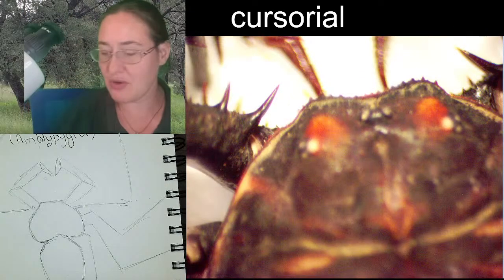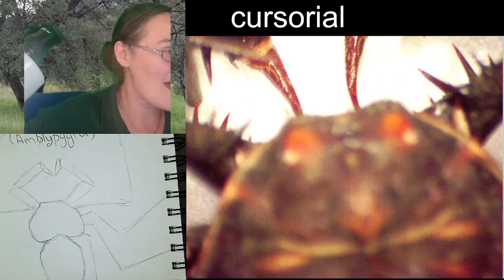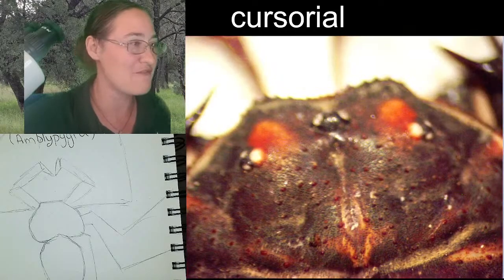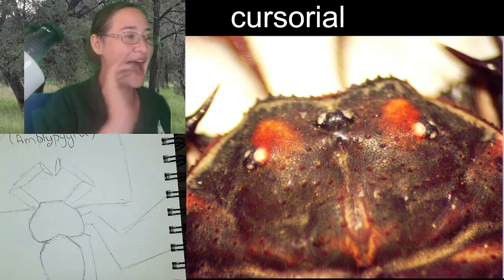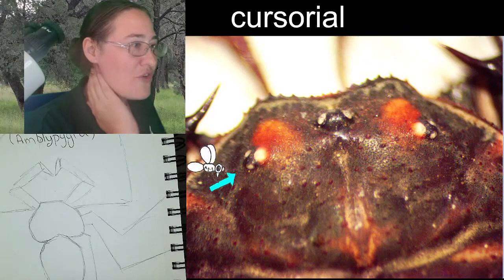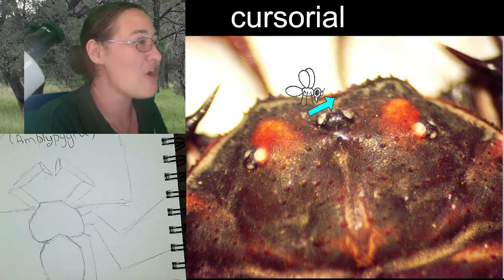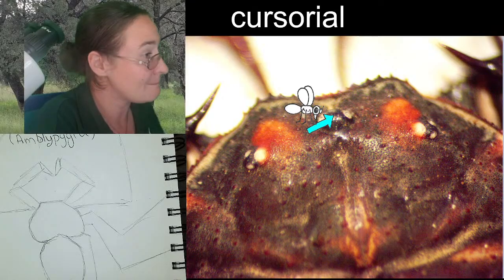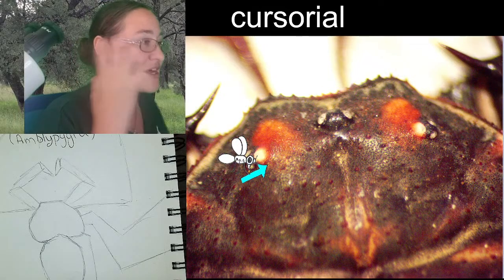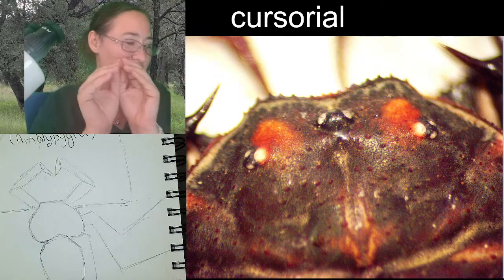I don't have the ability to move the specimen as much today because I can't just pick up a pin and swoosh it around. But we can check out the front of this carapace. What I found most awesome when I first put the specimen under the microscope was I believe there are three clusters of three eyes — three over here on the left, three on the right, and from this angle we can only see two of the center ones. Each set of three is not only a cluster of little simple eyes, but they're on little mountains — little hills — so they can see in many directions.